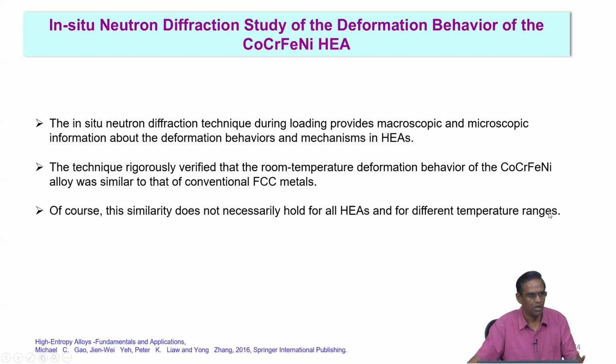So, this is just one coincidence that it appears similar, but for detecting the deformation behavior very closely, you need these kinds of neutron diffraction experiments, which can capture the deformations much more closely.